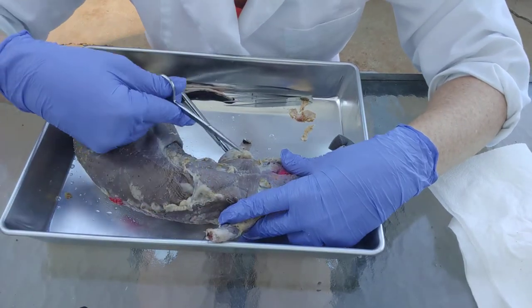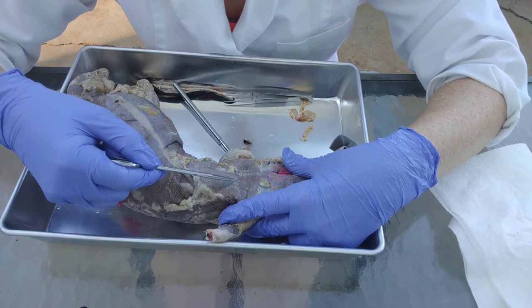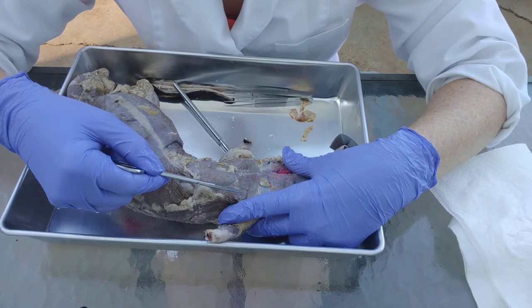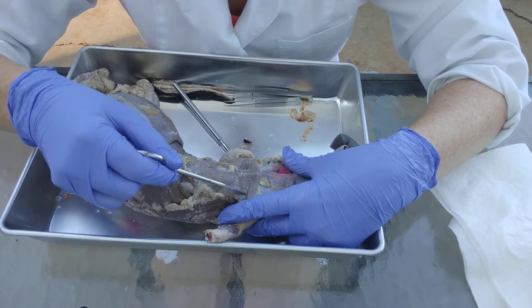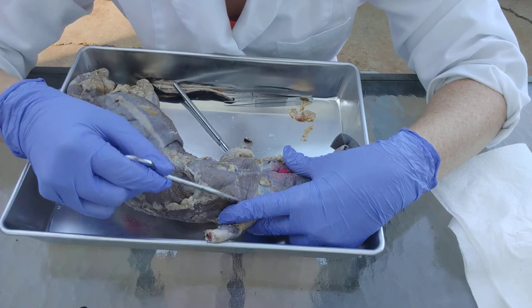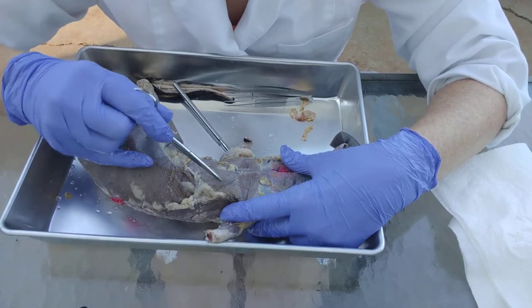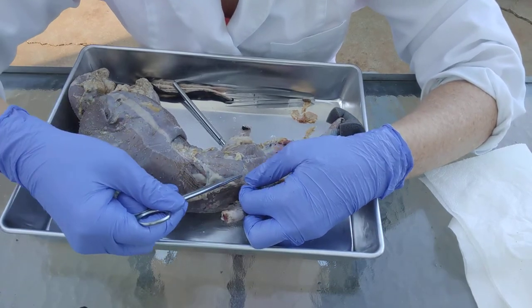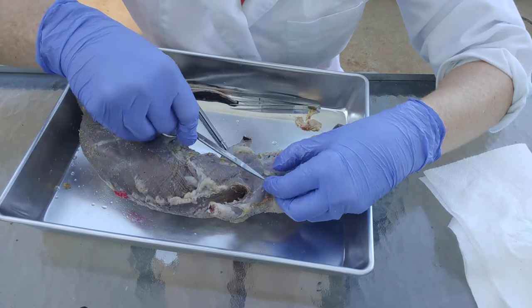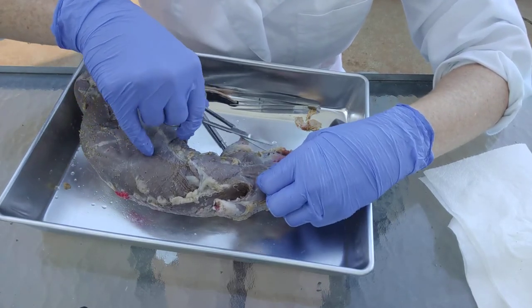Remember that muscles are organized into fascicles — skeletal muscle has fascicles, which are the bundles of muscle fibers, the cells. Because those fascicles are bundled, they create organization, and that creates these stripes. When you look at the muscle, the muscle will have stripes, and you want to make sure you can see those stripes when you're dissecting.